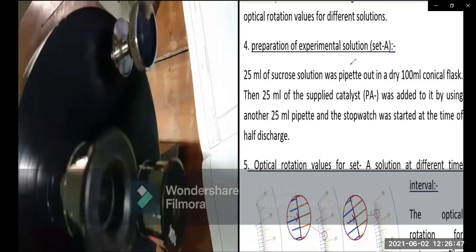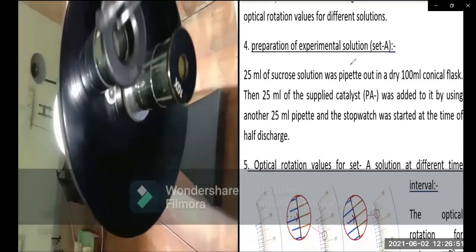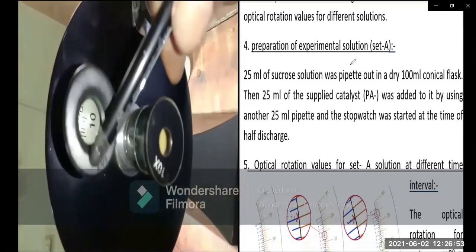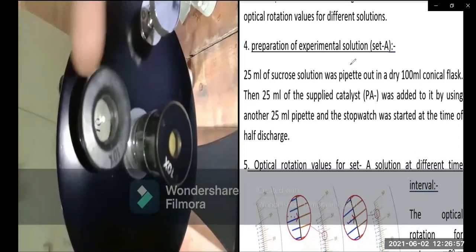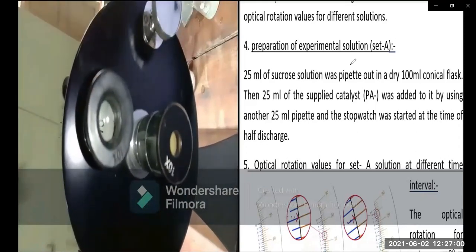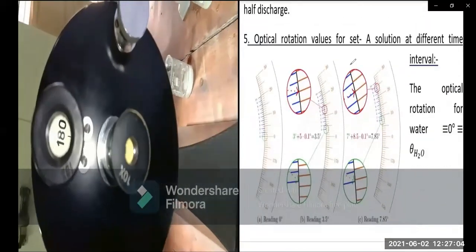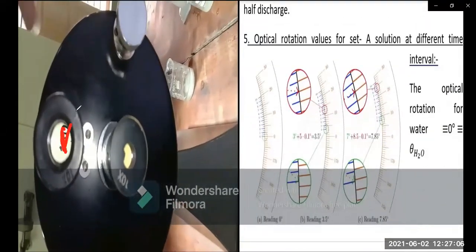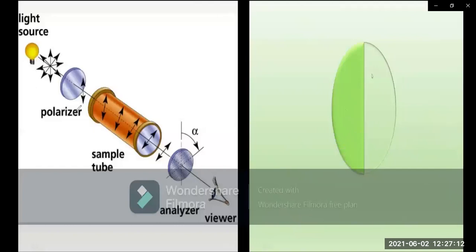We have to make a solution. We have to make the acid concentration, and we have to make the reaction fast and slow. We have to make the strong acid fast, and increase. We have different data. We have to make two different scales — the normal scale — so we can see the results.